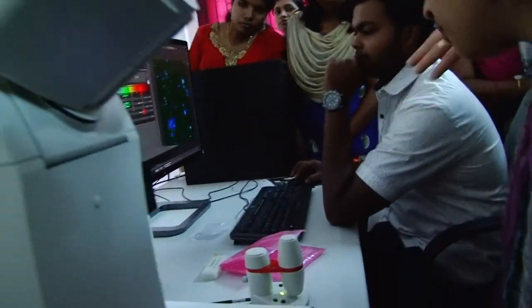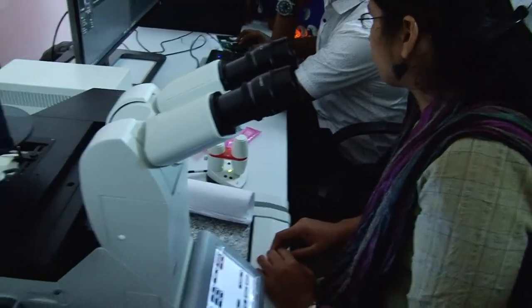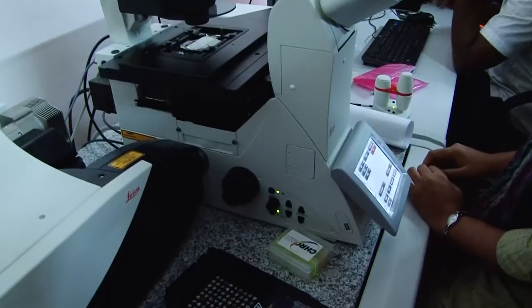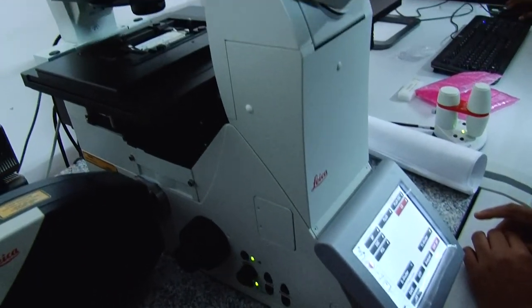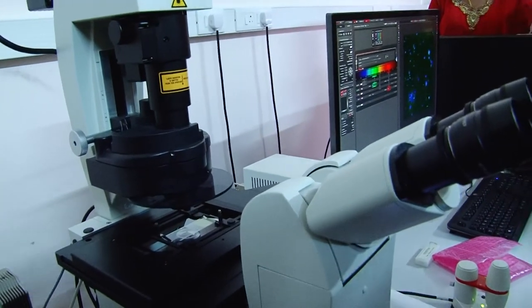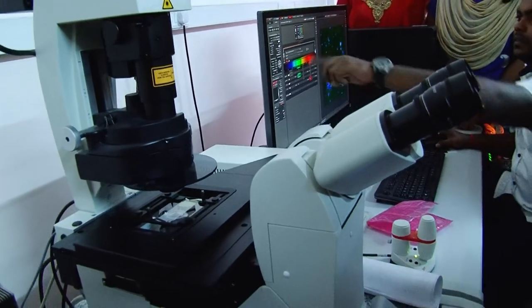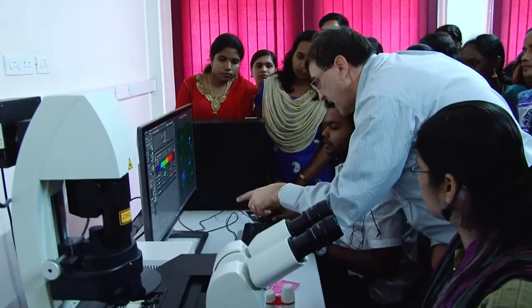You're good. So now, again, always on the microscope. Find the specimen first with your eyes. Step A, focus what you want, right? Find the specimen, focus what you want, and now since it's confocal, we set up our times, we picked our top, we picked our bottom, we're running a stack. So it's running? No, not right yet, but it's running right now. Yeah, go ahead, start it.